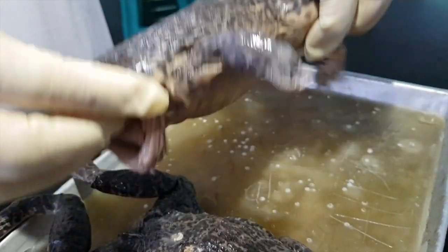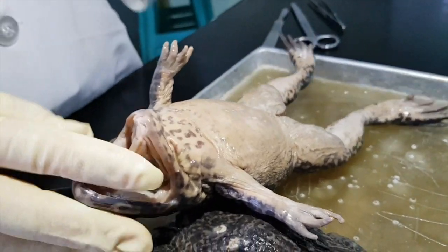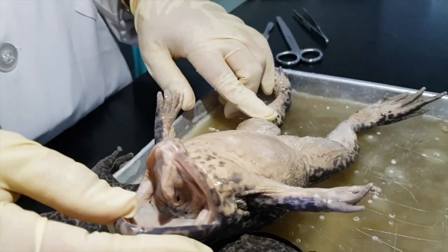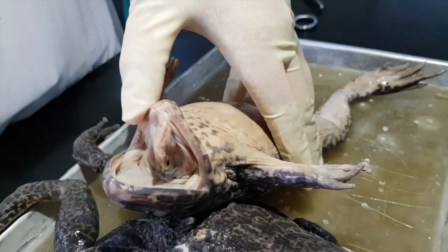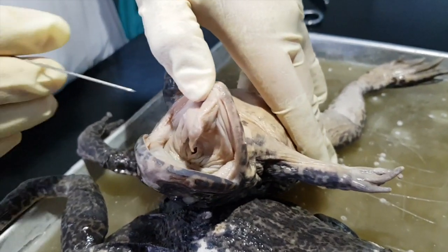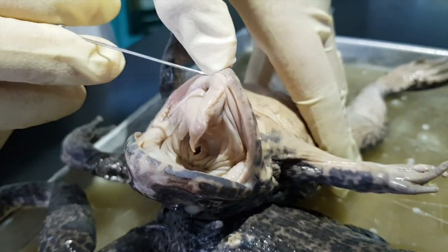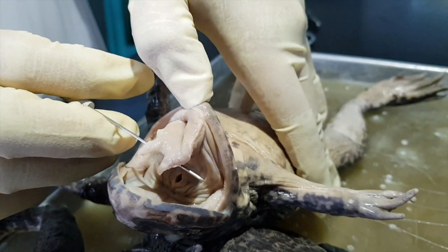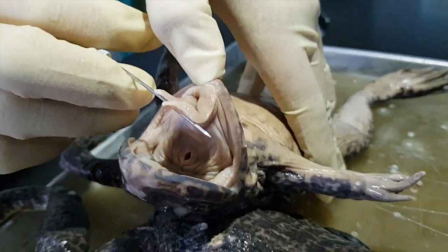And frogs have two types of respiration: buccopharyngeal respiration and cutaneous respiration. So they make use of their skin for respiration purposes. And in the mouth, although these are parts of the digestive system, you can see here the presence of the tongue that is attached on the anterior portion. So when they release their tongue, they release the posterior part to get their food or insects.